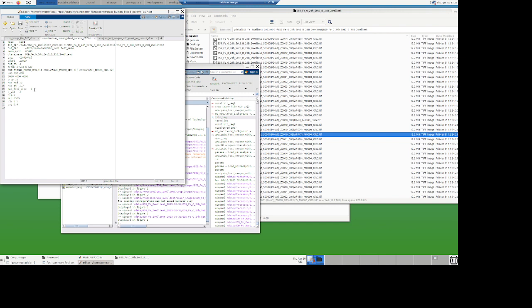Max size is basically how small of a spot do you agree to take? I know the term is terrible, but I authorized all the way down to 1 pixel, so very tiny. Can't have smaller than that, 1 pixel.